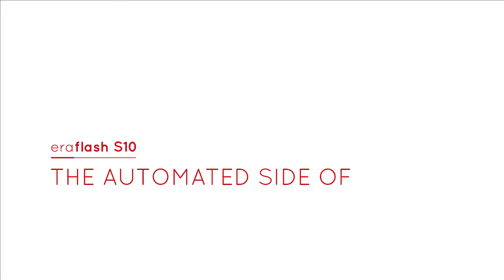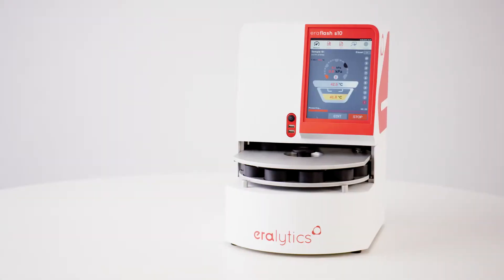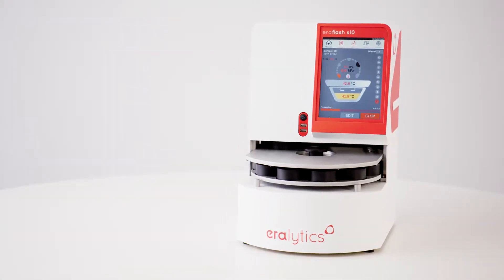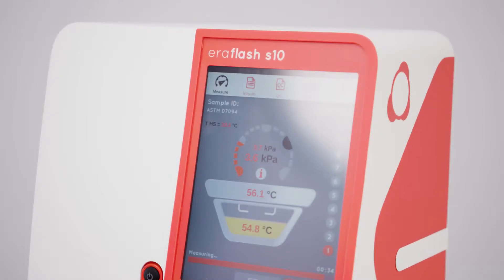ERAFLASH S10 – The Automated Side of Safe Flashpoint Testing. The ERAFLASH S10 is the ideal instrument for high-throughput flashpoint measurements, allowing for the automated analysis of up to 10 samples.